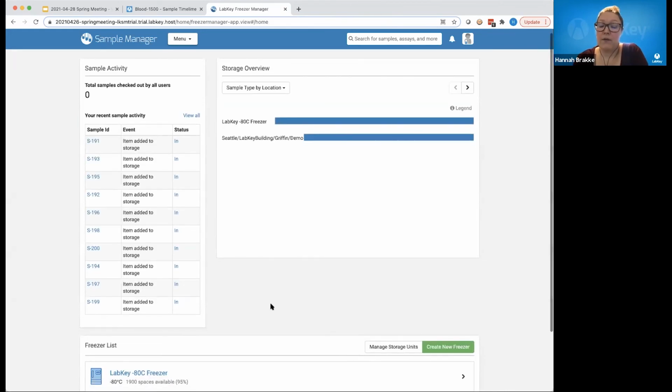But in order to fully lay out that feature, we would want to have a little bit of a redesign on this dashboard. So it's certainly on the roadmap to consider, and feedback we've heard from quite a lot of folks as well.